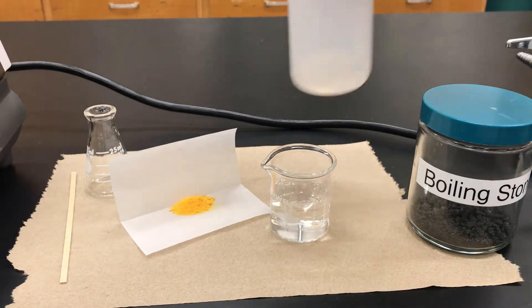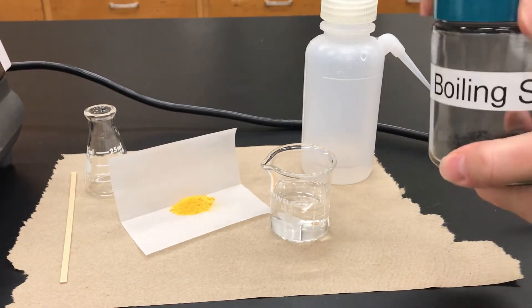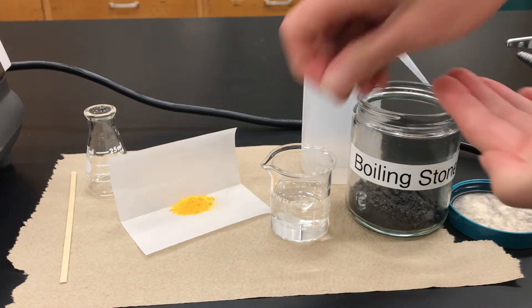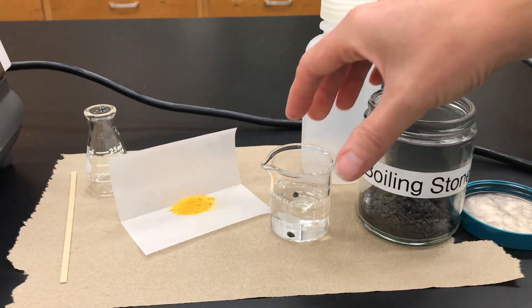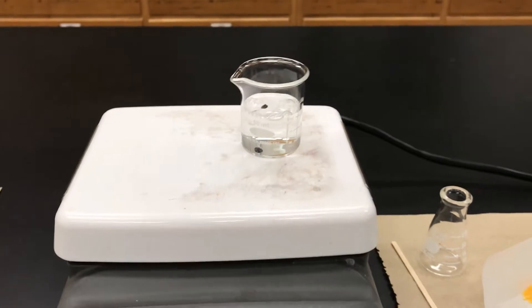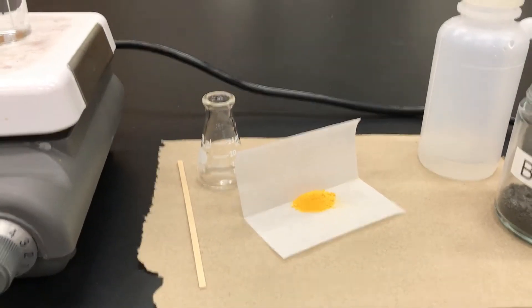I'll first put some water into a small beaker and this is going to go on the hot plate to heat. Next I add a few boiling stones — boiling stones are little pieces of rock that ensure you have a smooth, controlled boil so that there aren't any unexpected bumps or bubbles that erupt vigorously. I'll put that on the hot plate, turn it up, and bring it to a controlled boil.